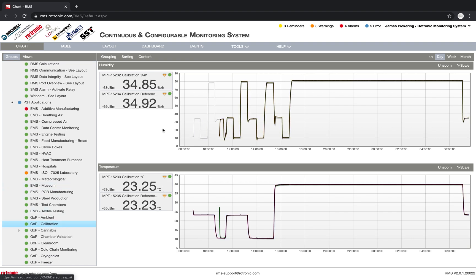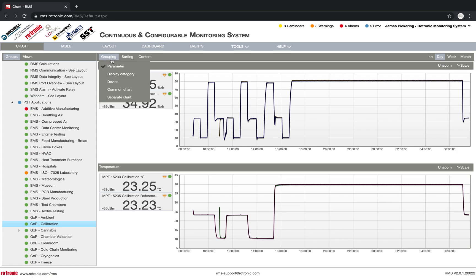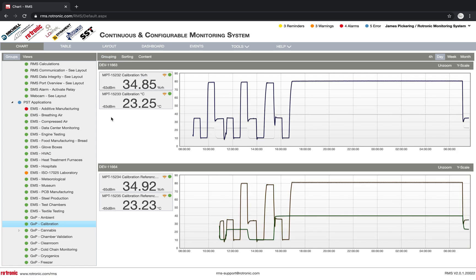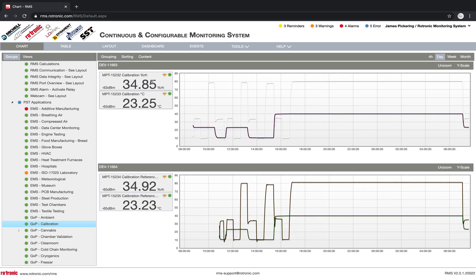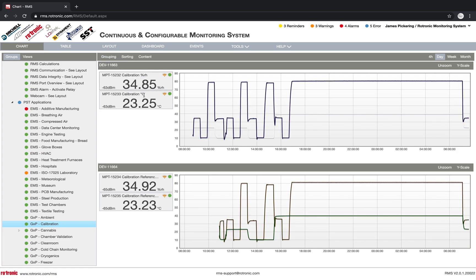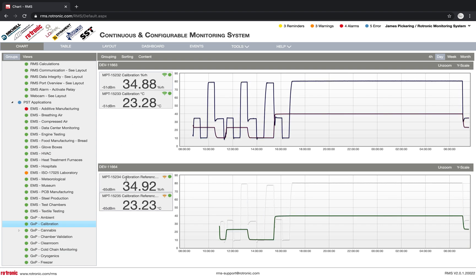So as you can see, I have two different probes that are running. If I go into grouping and I set up by device, I can see that I have my device that's under calibration here. And then I have my calibration reference here below.